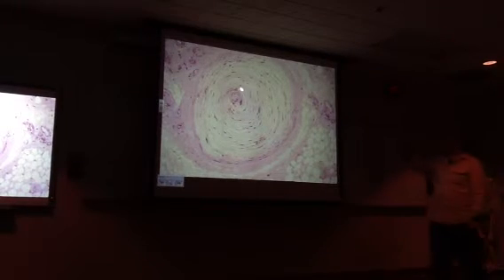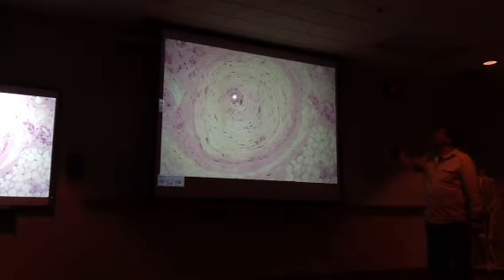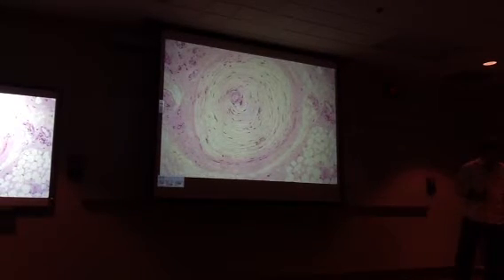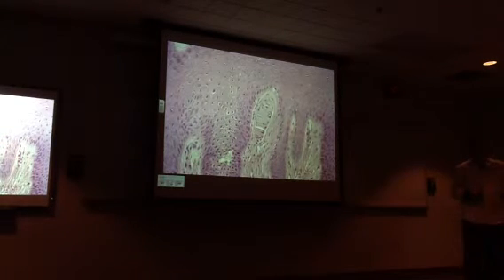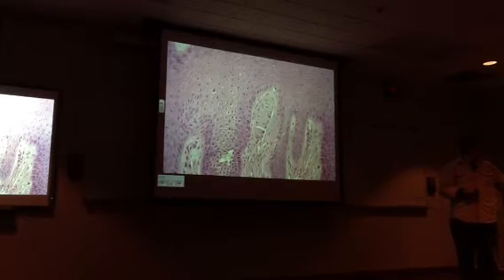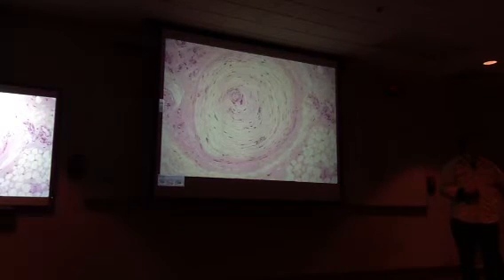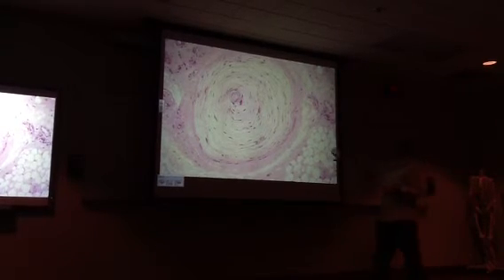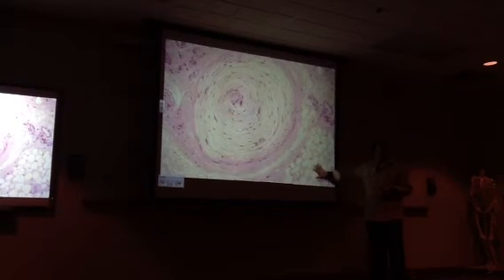Okay, and the very tiny pink spot in the middle is actually the axon. Both in this one and in these, as you get near the very end, the neurons lose the myelin sheaths. These are touch receptors, so very fine touch on the fingertips. These are deeper, where the dermis and the hypodermis come together, and those are more like pressure sensors. And I know this is hypodermis because I see all the white fat.